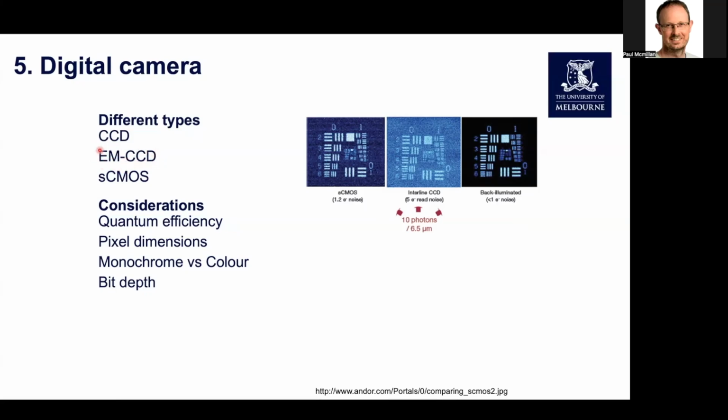This is ideally set up for single molecule imaging, so fairly faint samples. We have other systems set up with scientific CMOS cameras, which again have very fast readout speeds, so would be very useful for live cell imaging type applications.